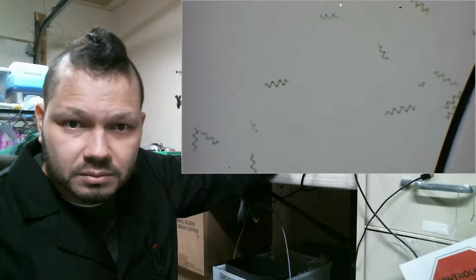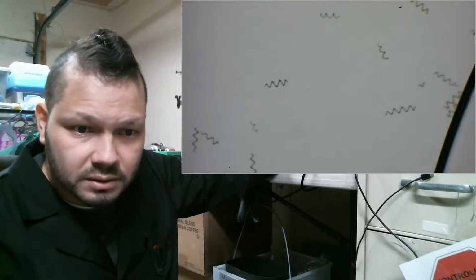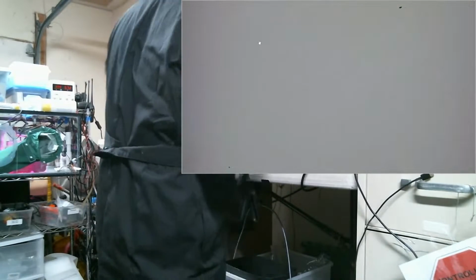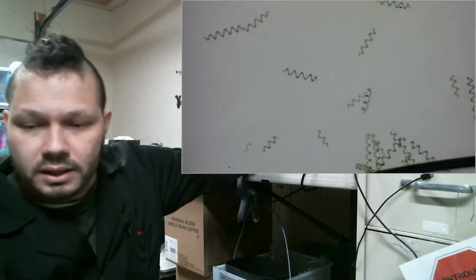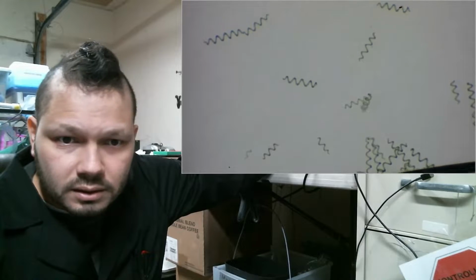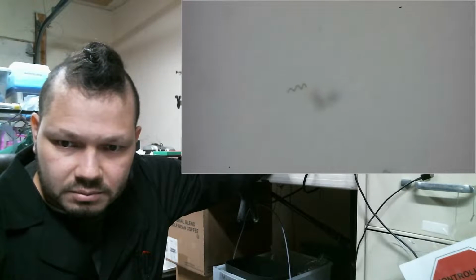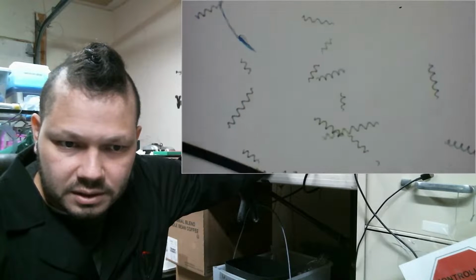Now these look pretty unremarkable. And then I'll do the control. 18. Now I'm trying to find bunches of algae, that way I can take measurements of a bunch at a time.